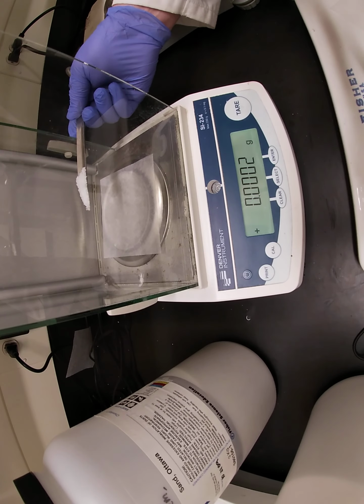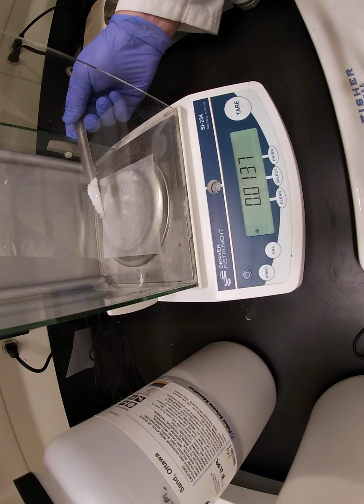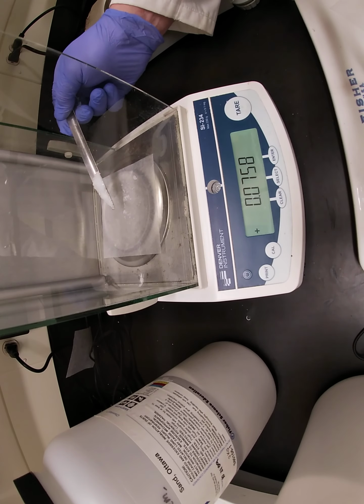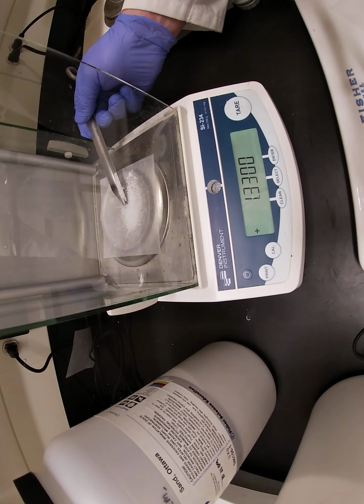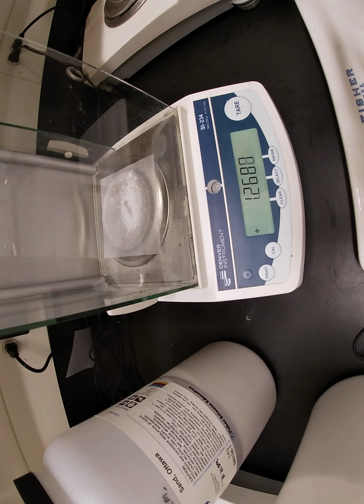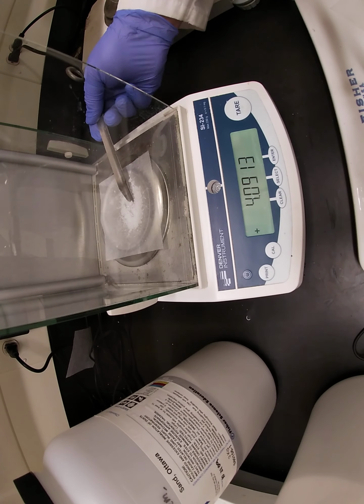And we're going to get this tared to 0 maybe someday. There we go. And that's a bit much, so we can knock off a couple of those big chunks.